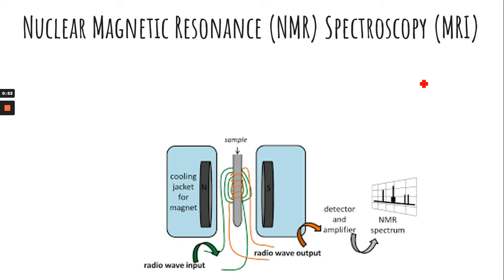Today we're going to talk about nuclear magnetic resonance, which is NMR. You might see it referred to as HNMR. The one there would indicate that it is the isotope of hydrogen with one proton. In the real world, it is called MRI. So in the hospital, you can go get an MRI so that you can see the inside joints and tissues. That's an MRI, and it's the same thing as an NMR. It's just done on your body instead of on a sample.